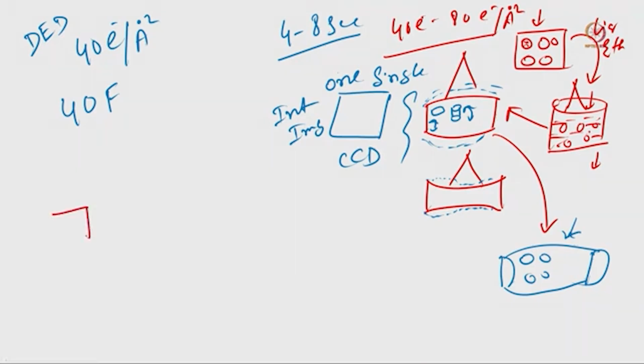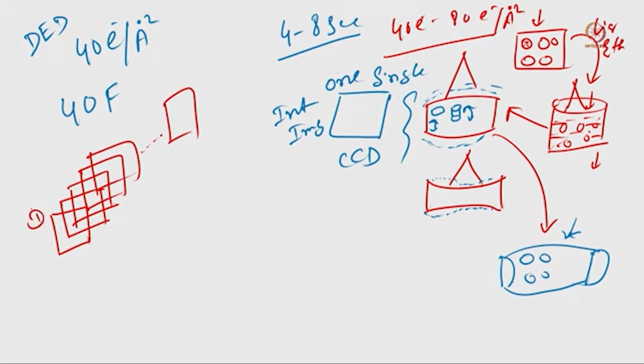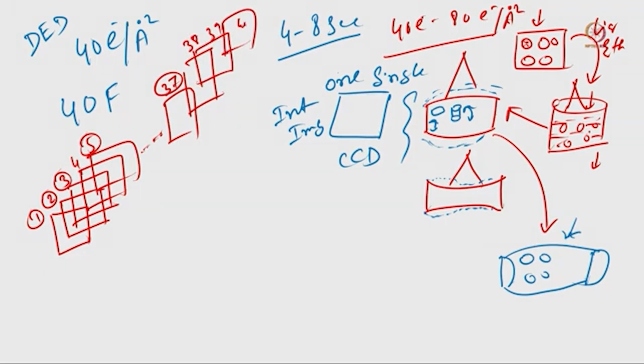what we are doing is collecting one frame, then a second frame, then third, fourth, fifth, and keep going on, and finally we are collecting. If we give names 1, 2, 3, 4, 5 and keep going on like that, now you consider this is the 37th frame, then this is 38, then this is 39 and then this is the 40th frame.